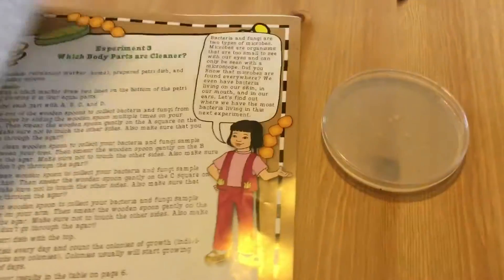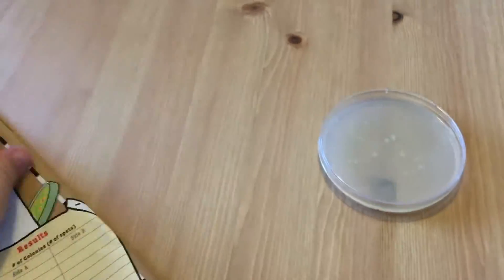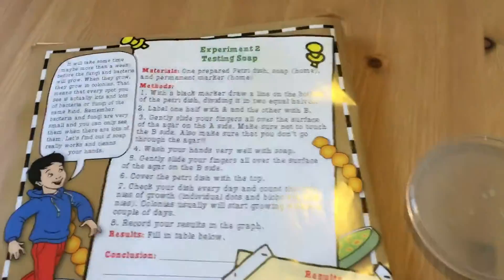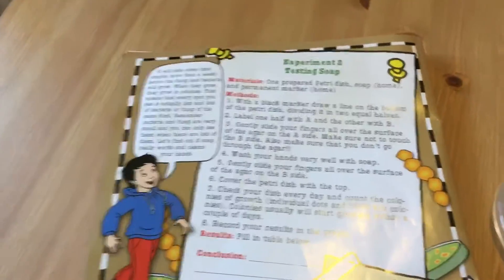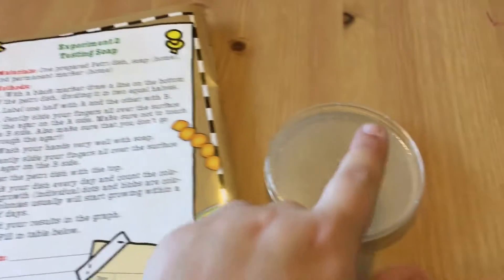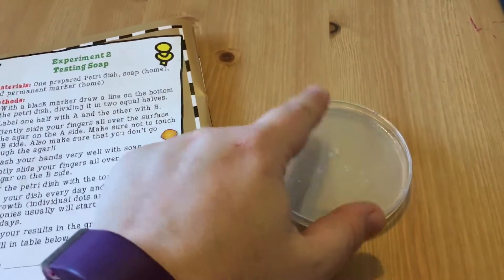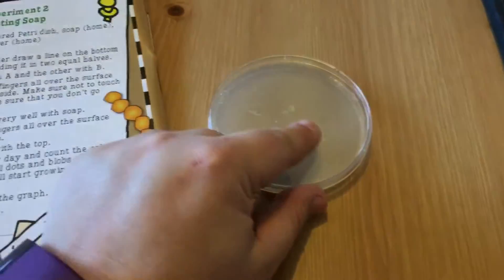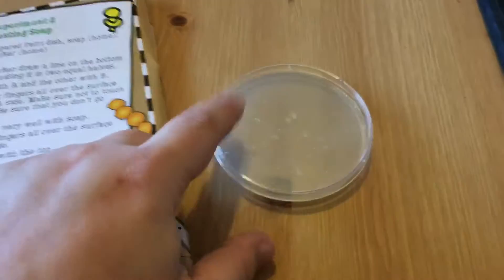And today we are going to be doing experiment two, which is testing soap. So what we are going to do is take the petri dish and draw a line on the bottom of the dish and label one side A and one side B.